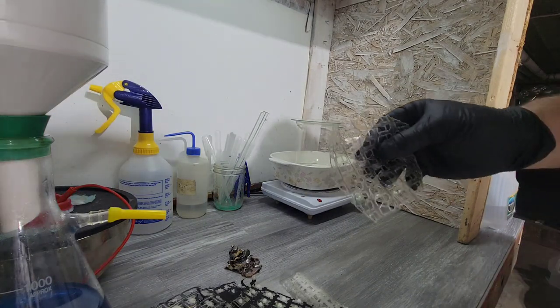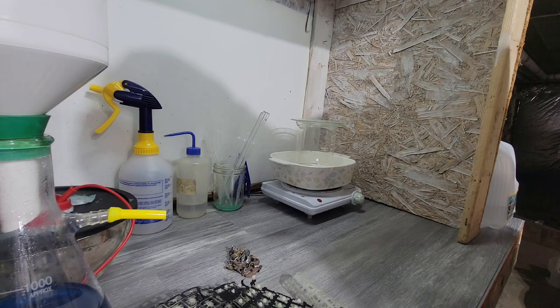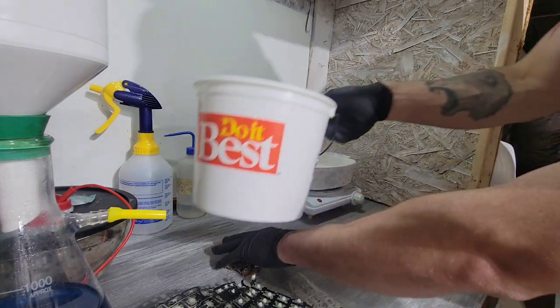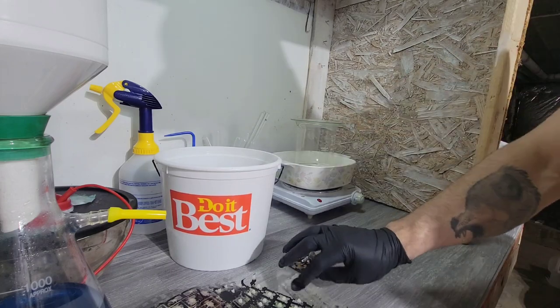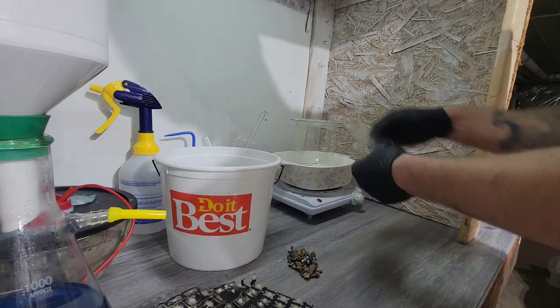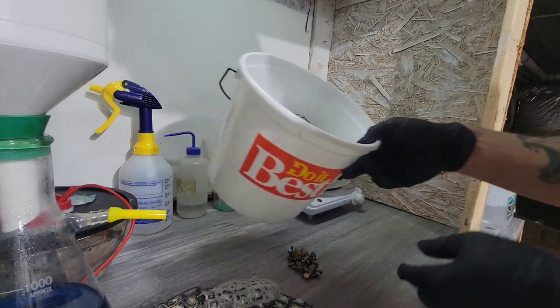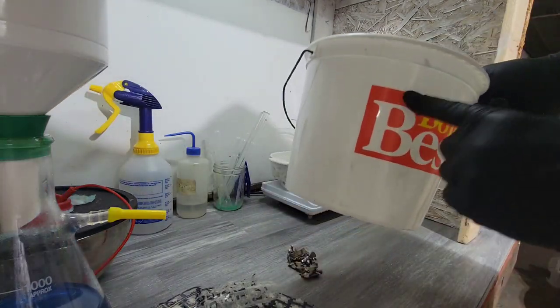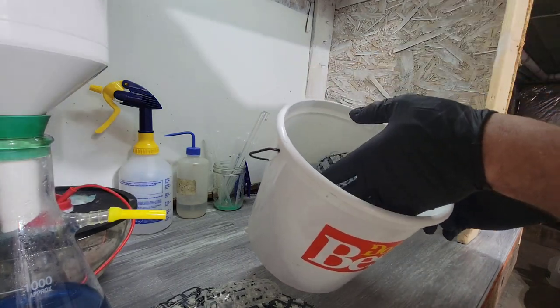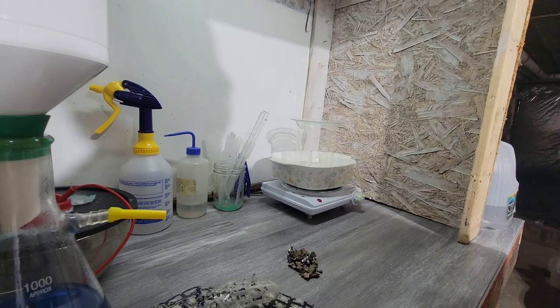I got more that I did before I made that video of. I'm going to make sure that this is here so I can put them directly in our bucket, because they're probably going to contain some silver nitrate when I take them back out of solution. So I'm not going to throw these out right away. What I'm going to do is rinse them with tap water, and then all the silver nitrate that's left on here will turn into silver chloride and fall down to the bottom of the bucket. I'll then collect it and put that in my silver chloride jar.